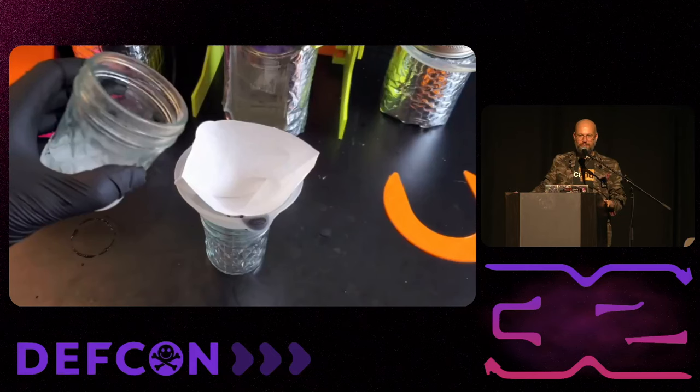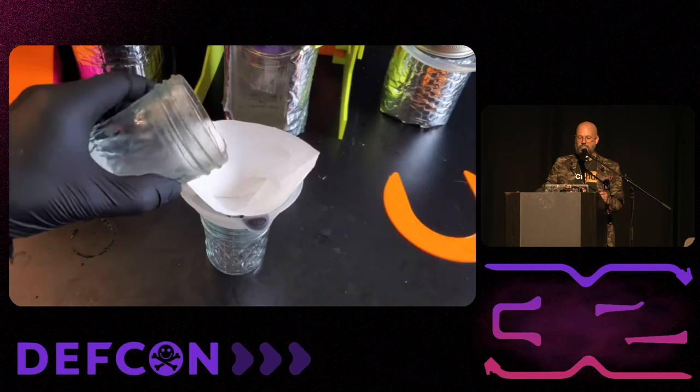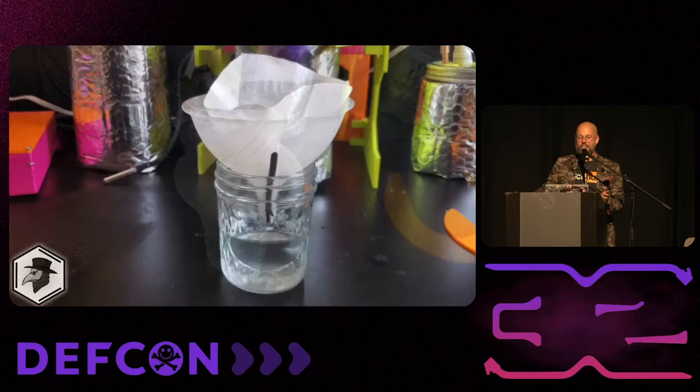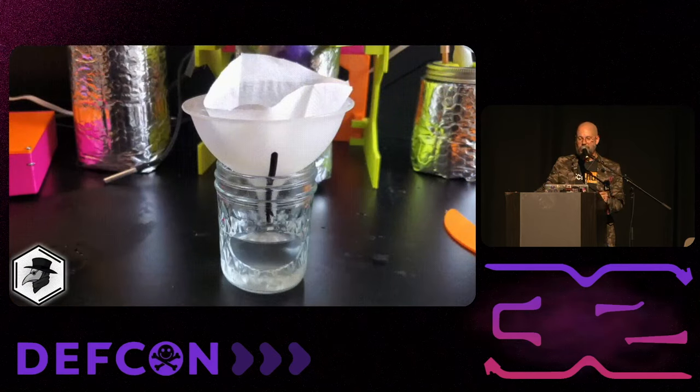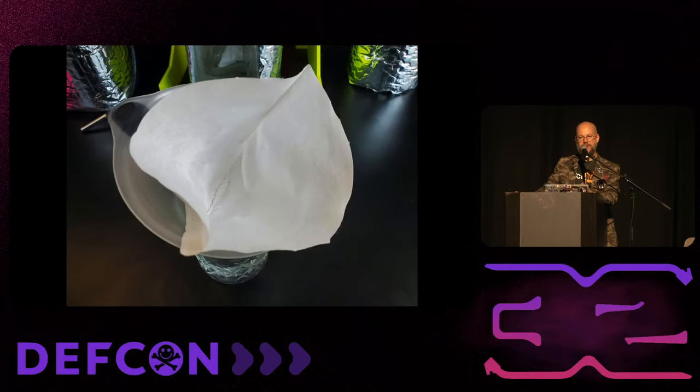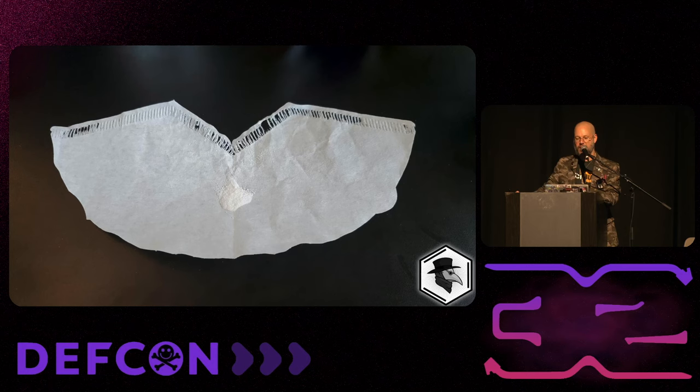At the end, and what you'll see me do soon, is you'll end up with the inner jar filled with active pharmaceutical ingredient in a solvent of some sort, and then you pour it through a coffee filter, and then you let it dry. And it basically looks like this. It's a fairly simple thing. You dump it out, you let it drip for a while. Now, we're not gonna have time to let it dry and watch, but once it does, you can see there's this little powder that's left on the bottom, and then you peel it open, and there's your stuff.